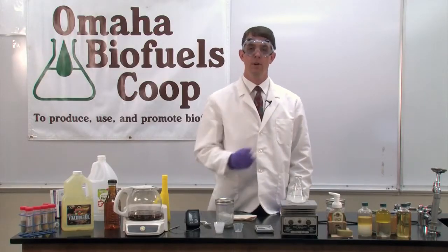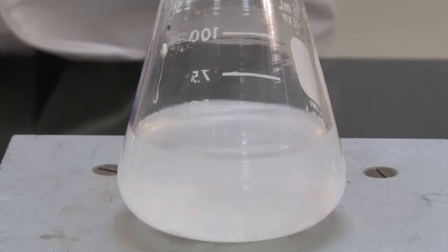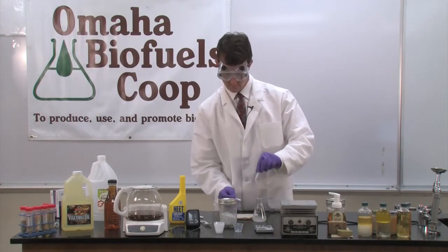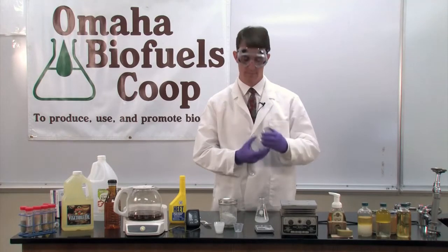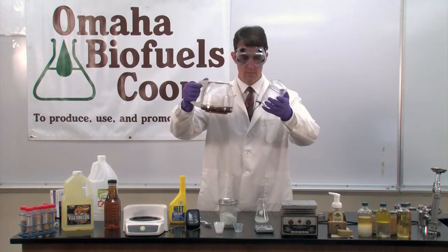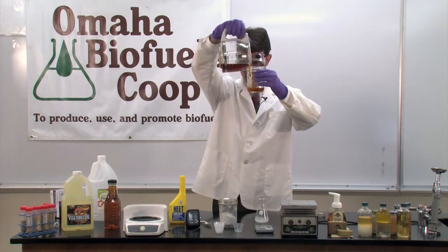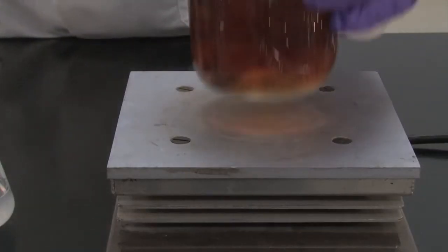It'll take about three minutes for all of the lye to dissolve into the methanol, forming the methoxide solution. Now that the lye is mostly dissolved into the methanol, we can remove the stir bar. We'll measure out 200 milliliters of the heated cooking oil into our reaction vessel. Today, we're using a mason jar. We'll place the jar on the mixing plate and add a stir bar.